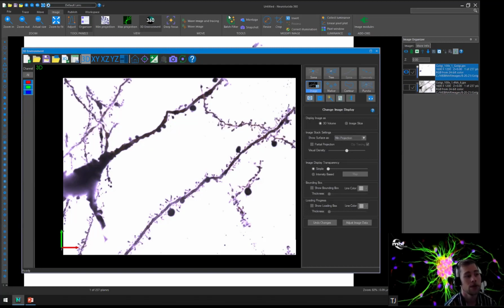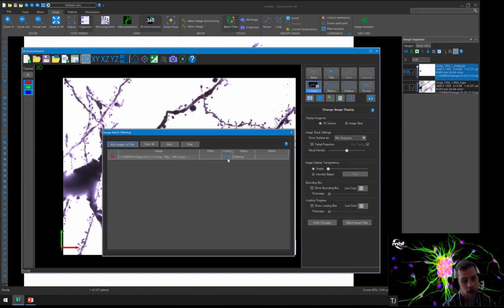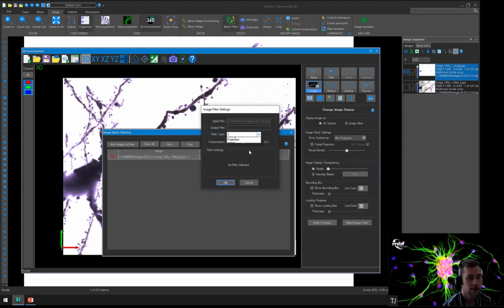So when we go to the batch filter configuration and select a filter to apply, a lot of the times when we look at the sensitivity, like in Golgi and in Vessel, or when we look at the in vivo filter and the band count or displacement, it's really going to vary between images or image rounds even. Let me walk myself back a little bit.